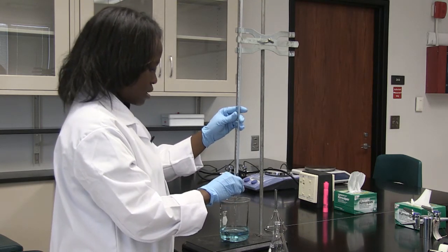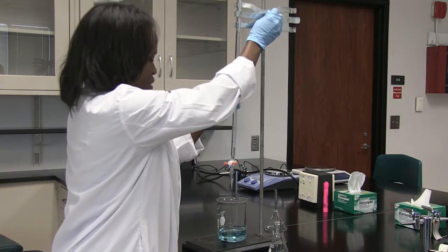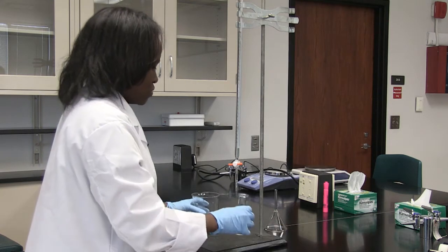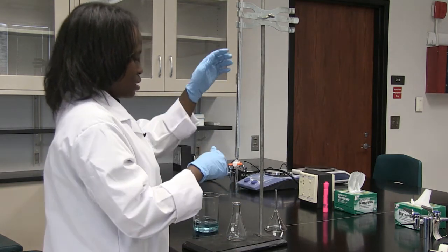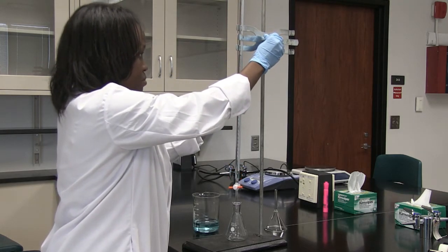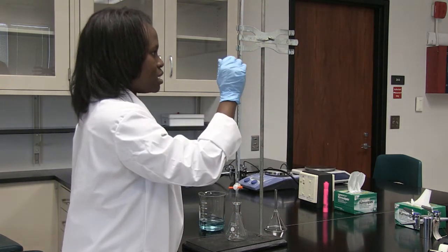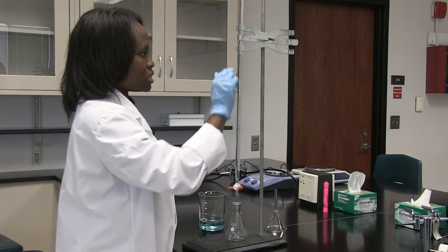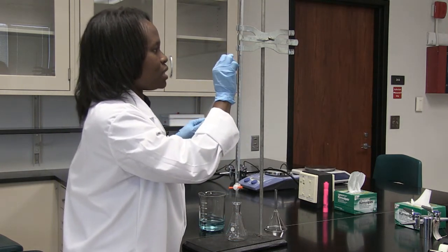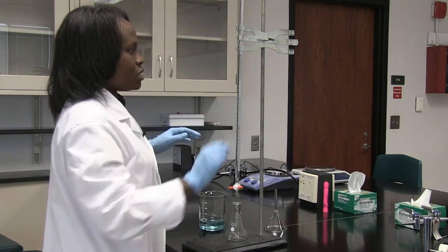So I got to the 20 mil mark, and the important thing about the burette is that you want to make sure that the liquid fills the tip of the burette, so that the accurate volume of water will be placed in the Erlenmeyer flask. Another thing to note, when you're measuring the volume, you want to make sure that your eyes are in line with this curvature formed at the surface of the water. This curvature is called the meniscus, so you want to make sure that your eyes are in line with the bottom of the meniscus. The bottom should be in line with the volume height that you want to stop at.